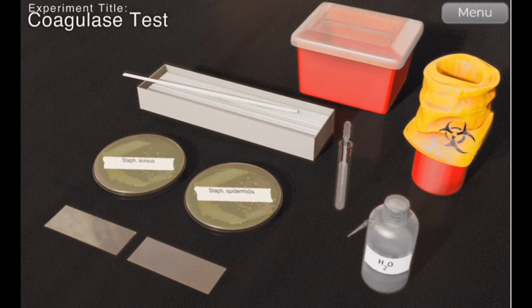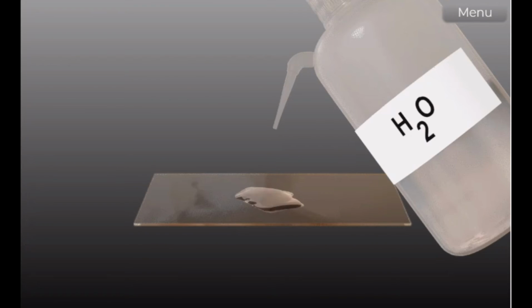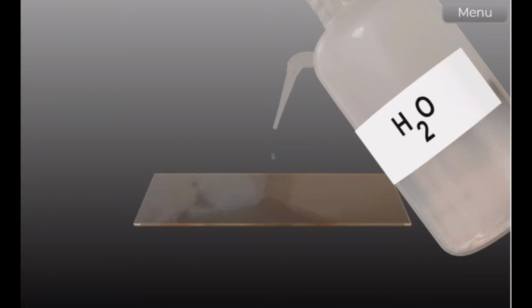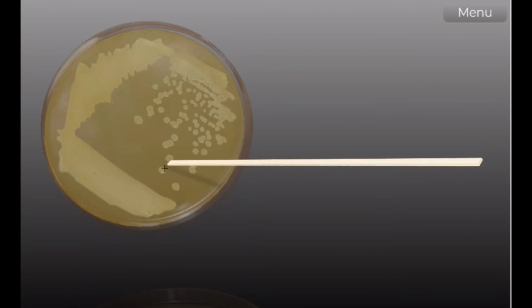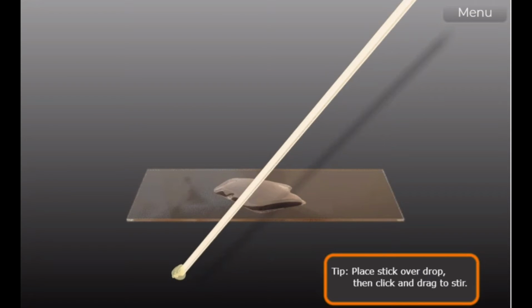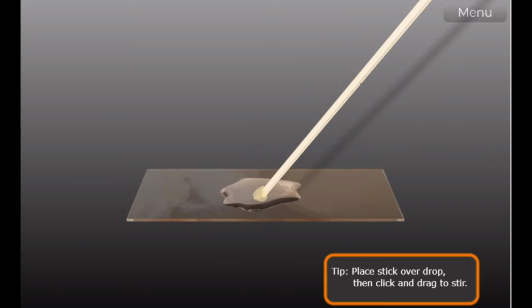So the first step of the coagulase test is we need to put a drop of water on each slide, and we will isolate the colony using a stick. Put it on the slide, mix the bacteria with water.